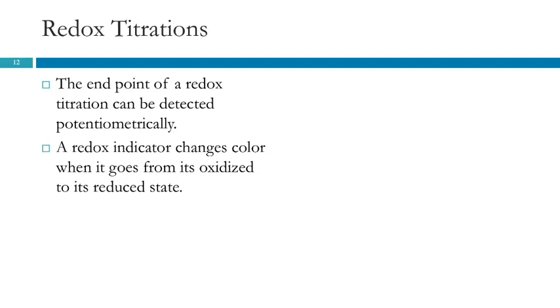This is an unfinished slide. So redox titrations, an example of that would be an oxalate and permanganate titration. Anything involving an oxidation reduction reaction.